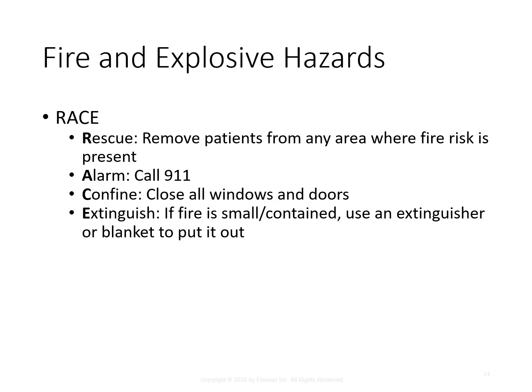Fire and explosive hazards. Fires or explosions in the laboratory may occur as a result of chemical or electrical accidents or carelessness with flames or other fire sources. We have an acronym to help us remember what to do in case of a fire, and that is RACE, which stands for Rescue, Alarm, Confine, and Extinguish. Rescue means to remove patients from any area where the fire risk is present. Alarm is when you call 911. Confine is when you close all doors and windows. And extinguish: if the fire is small and contained, you can use an extinguisher or blanket to try to put it out.